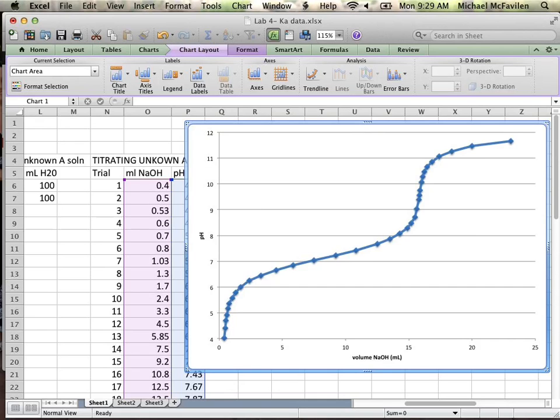When we completely remove the acid, what happens to our pH? It spikes. So what we're looking at is the exact instant where we've removed all of that acid. So it's the midpoint pretty much of these two. It's that vertical line. So our equivalence point is roughly the dead center of that.